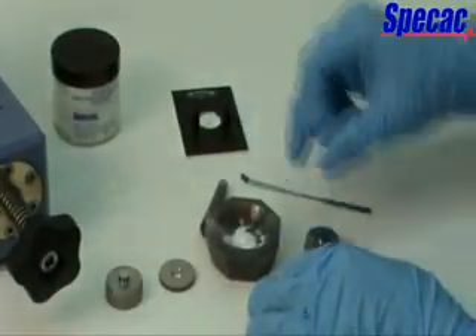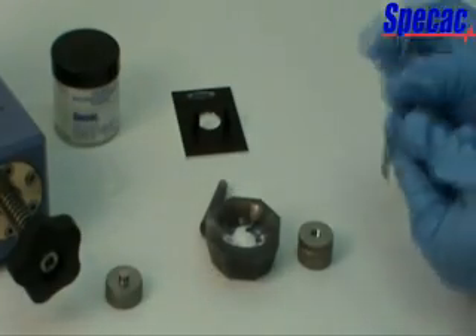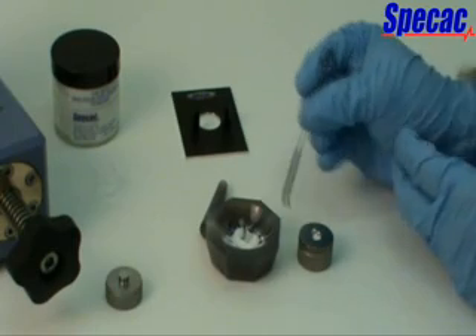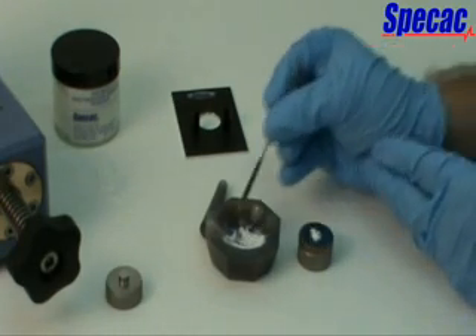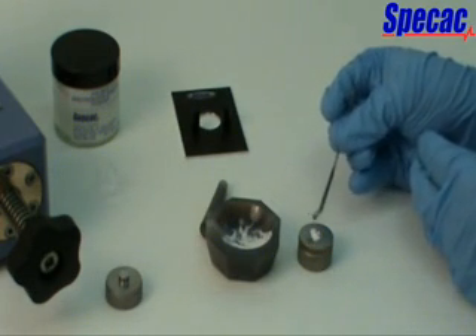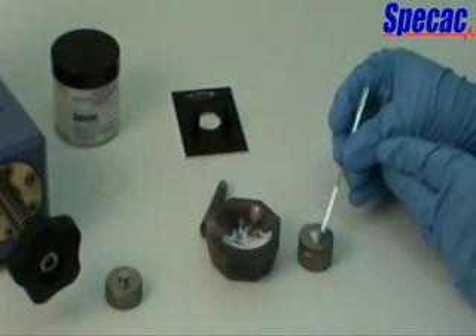When the sample has been ground sufficiently, place some of the KBR mixture into the central hole of the 7mm pellet die ring holder. The die ring holder part has previously been assembled to fit over the bottom anvil, which has the shorter central plunger piece. Fill the aperture hole of the 7mm pellet die ring holder with sufficient KBR powder mixture to reach the top. Using the edge of a spatula, ensure the powder mixture surface is flush with the 7mm pellet die ring holder's top surface.